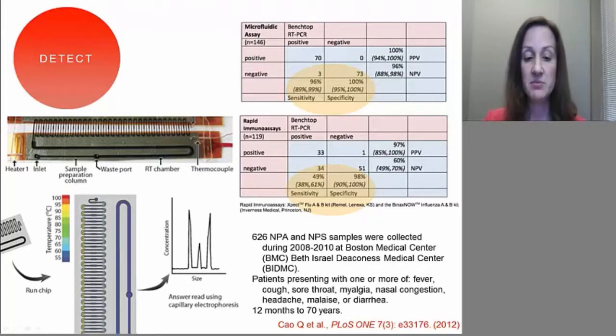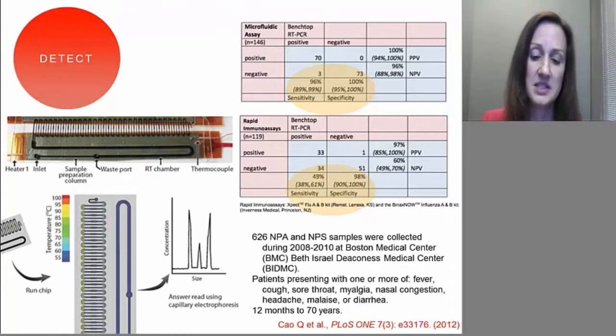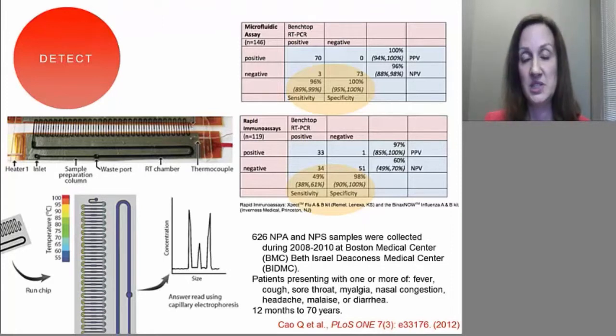And the sample needs to be pumped through the chip using a rather large pump in order to get the appropriate flow. The sample then needs to be removed from the chip for capillary electrophoresis on another chip. Although this could be done in an integrated system eventually, it would still represent another complicated aspect of the instrumentation that would require sophisticated control mechanisms.